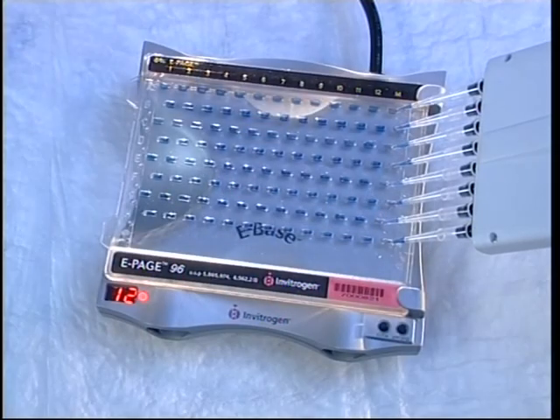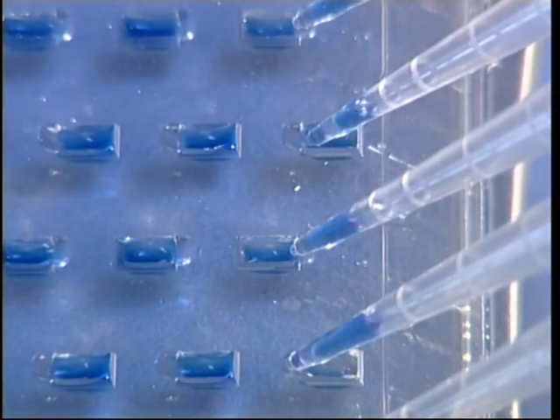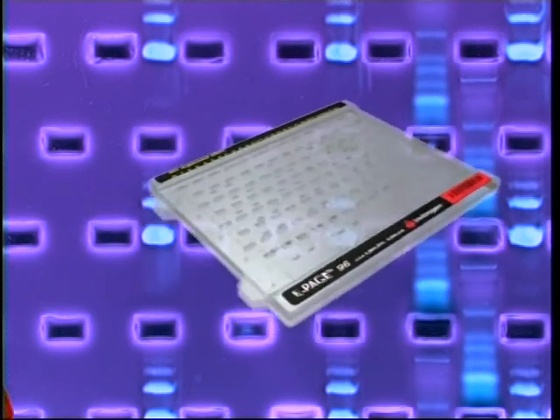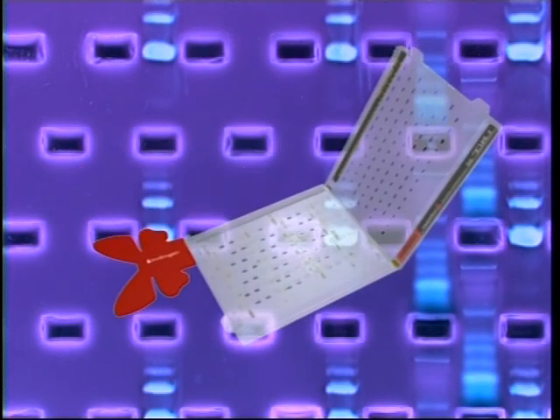The ePage 96 cassette wells are staggered to allow maximum running length efficiency with a 16mm separation distance. Removing the gel from the cassette is simple and safe with a butterfly opener. No damage is caused to the robust gel while opening the cassette.